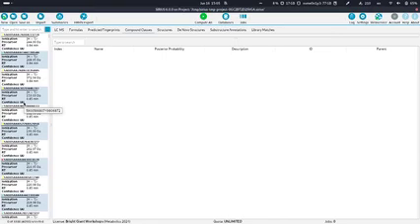Currently we don't remove them, so they are just flagged as gray boxes, or as lowest quality, and you can interpret this as to remove. So maybe in some later update we will remove them automatically, or we just give the user the choice if you want to remove them, but it's usually a good idea to not look into these gray features. They are really usually noise.